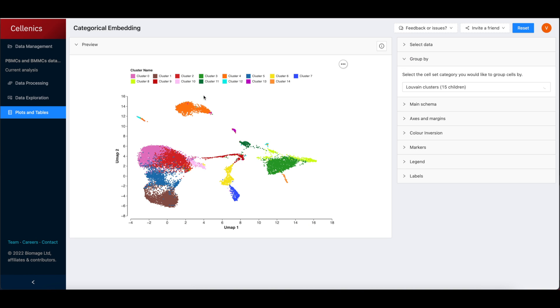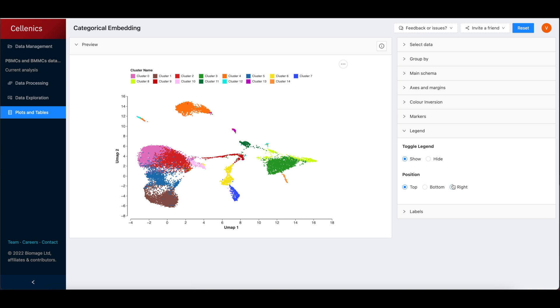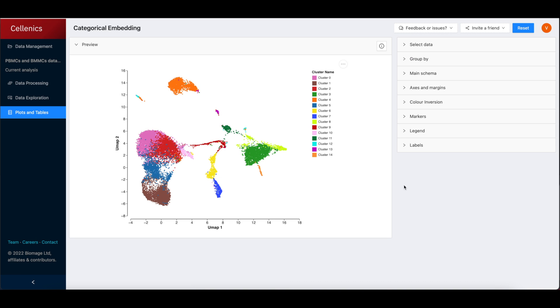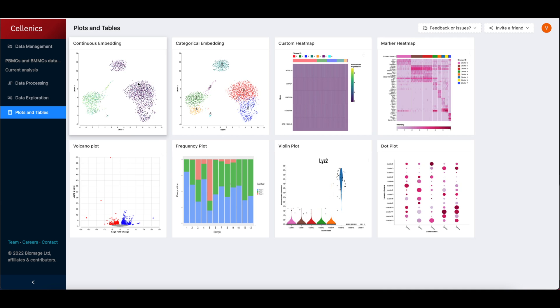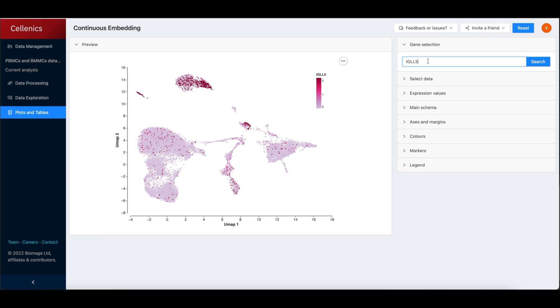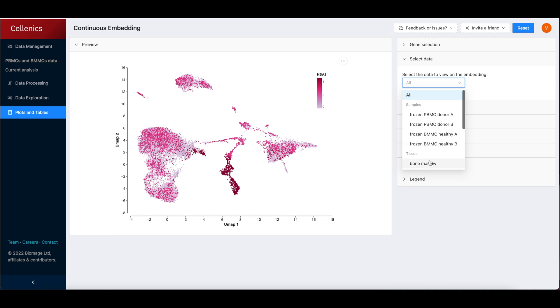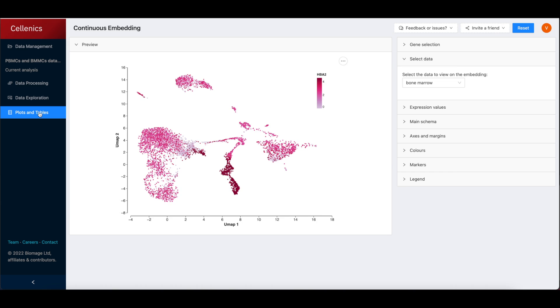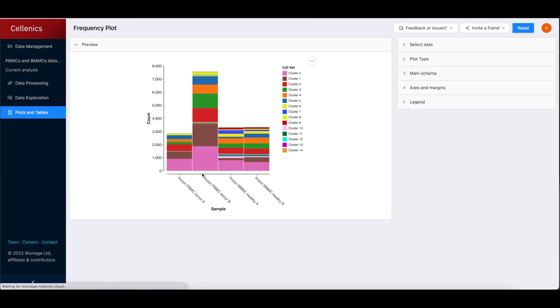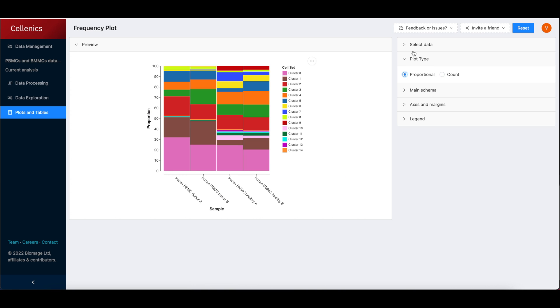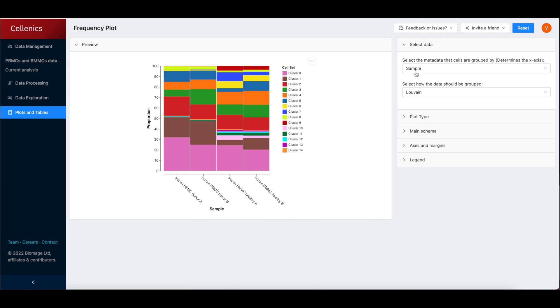Finally, the Plots and Tables module displays a range of plot options, with standard plots such as the UMAP embedding showing clusters preloaded with user data. Full control over plot features allows users to tailor each plot to their individual design preferences.